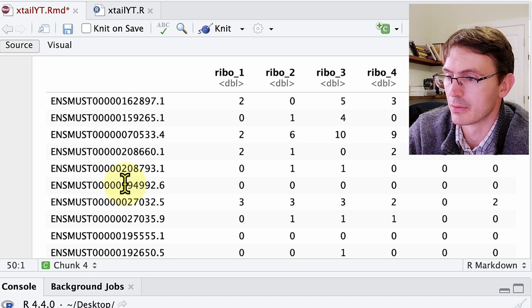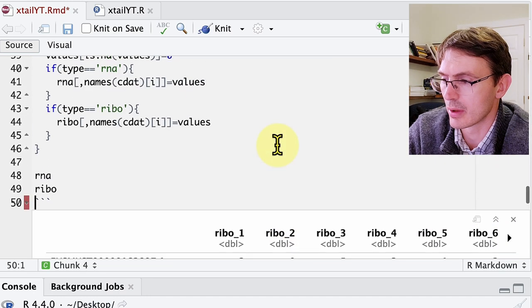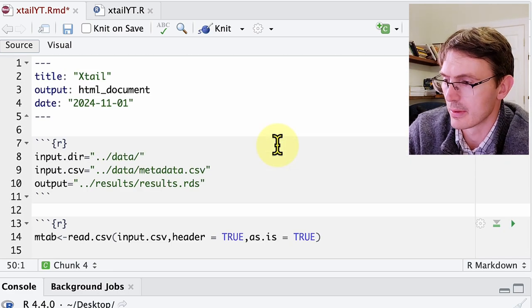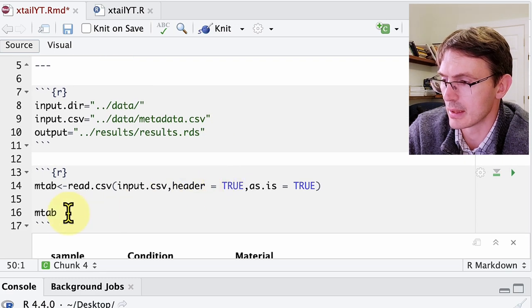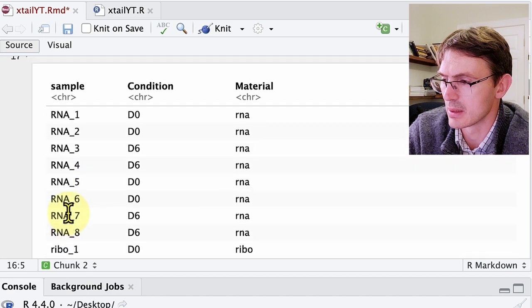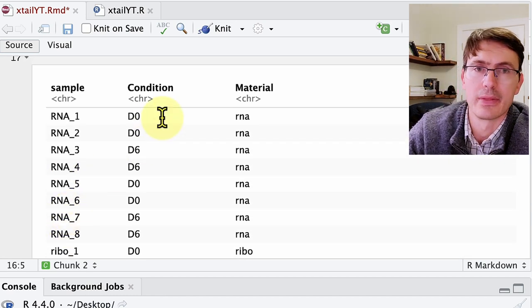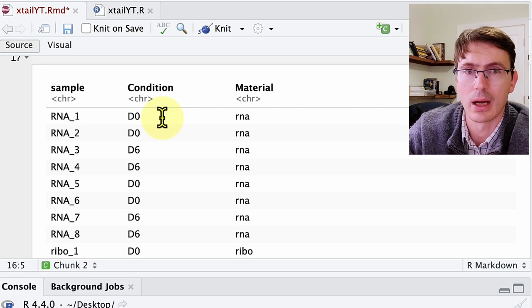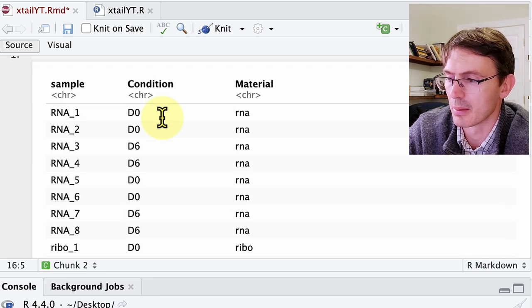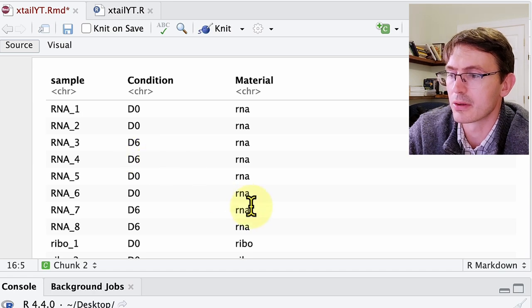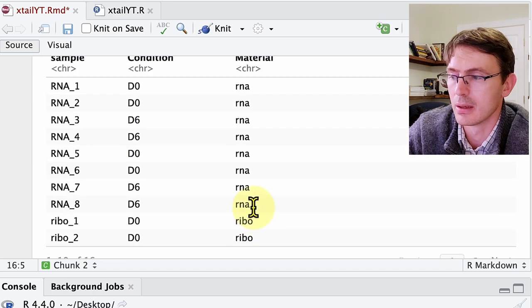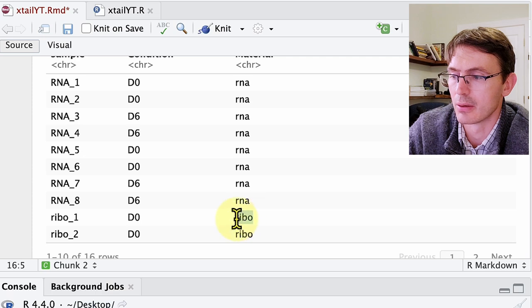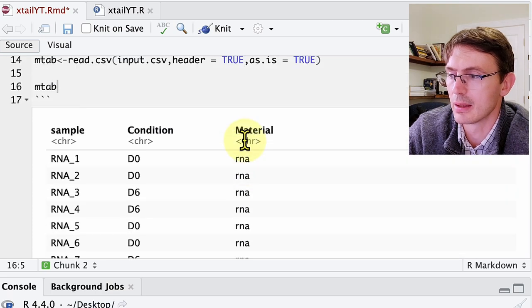Let me walk you briefly through this script. The first thing we do is load the metadata. The metadata looks very simple: it has the name of the sample, then the condition — those are the two different conditions we are going to compare to understand how translation changes from one to the other. Here we are naming them D0 and D6. The third column indicates what type of library we are dealing with — either the RNA libraries or the ribosome-protected fragment libraries, which we refer to as RPFs.